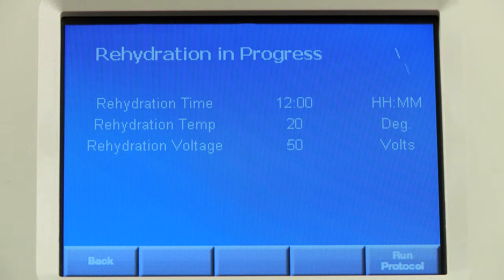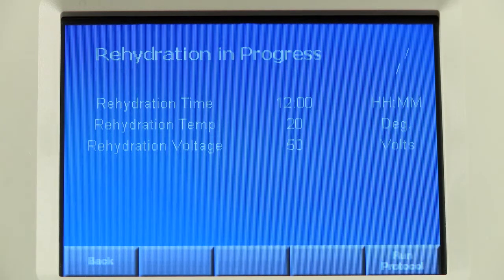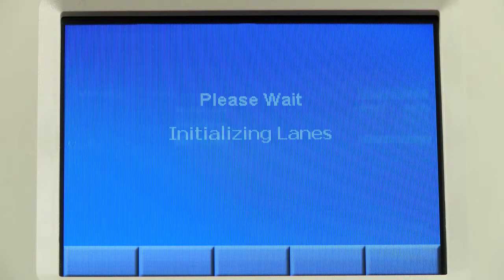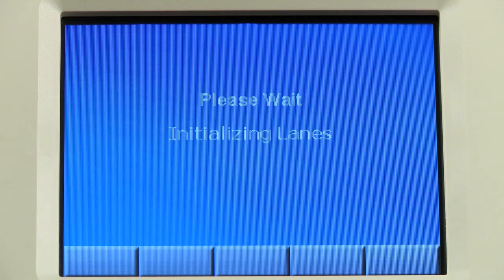If you have chosen to program a rehydration step, you will see the Rehydration in Progress screen. You can press Run Protocol to go straight to the Focusing step.